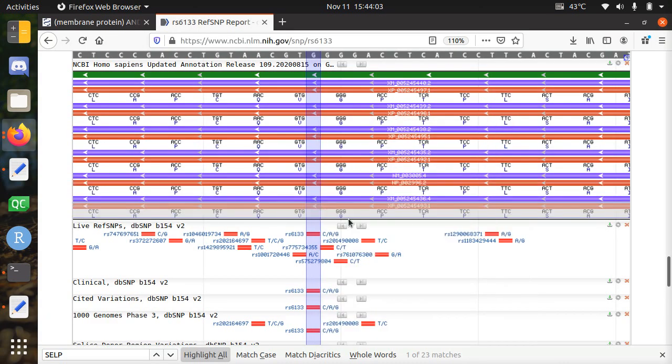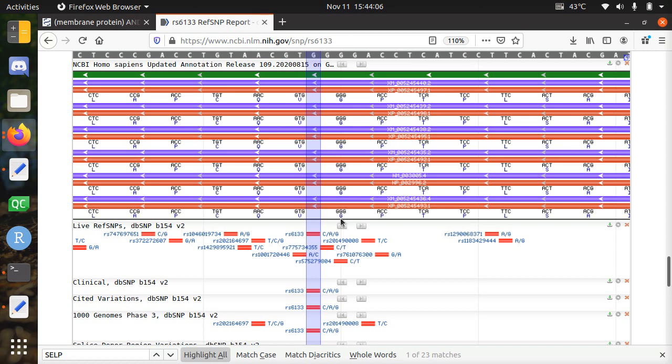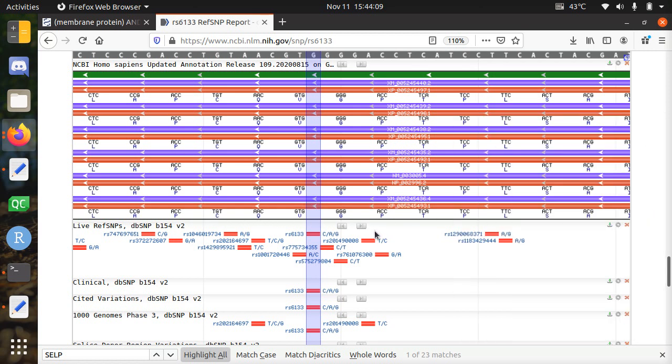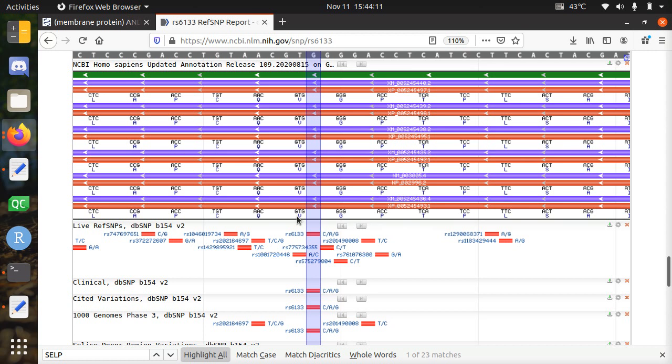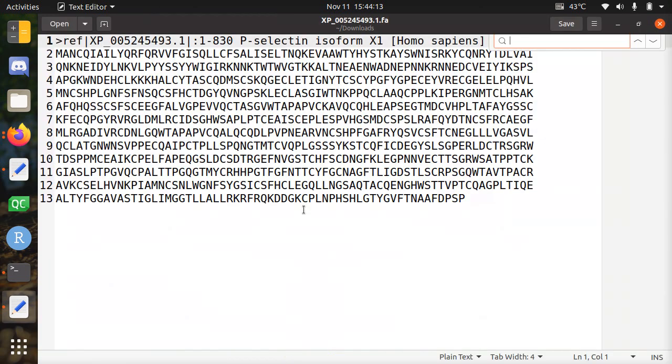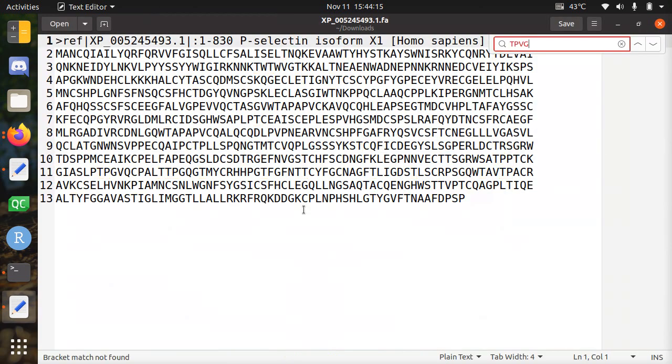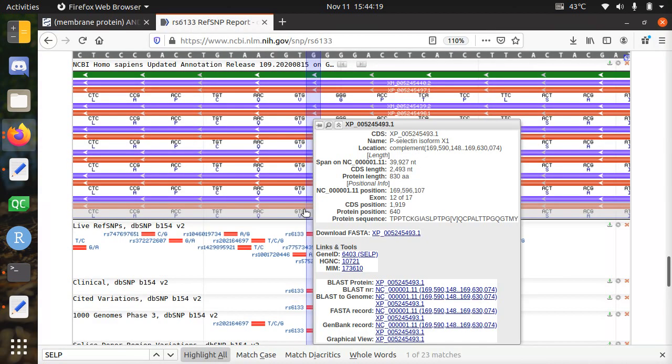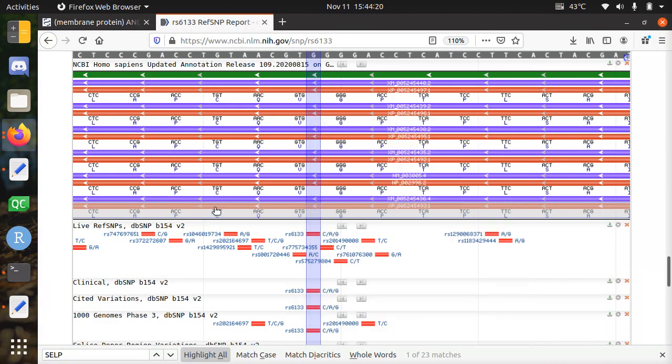But we can also figure this out. Because here below the amino acids are displayed. So it will be something at TPGV. Let's take a look at that. TPVG. Let's take a look.